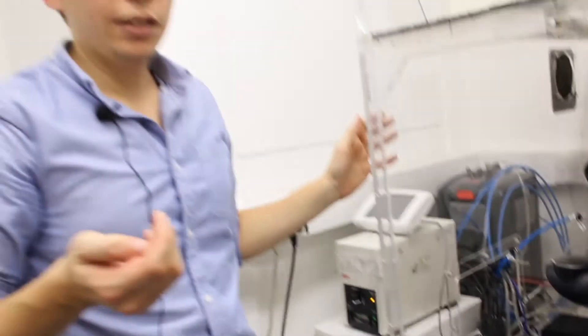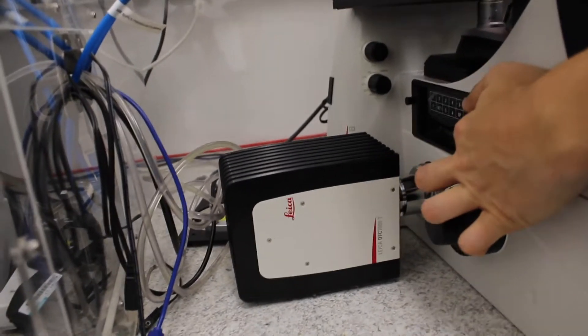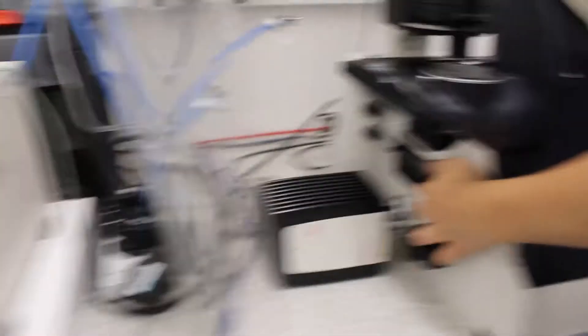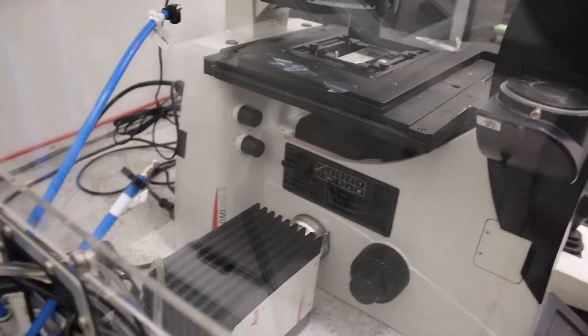Then you need to choose which filter cube you want to use depending on the sample that you want to see the fluorescence of. It's on this filter wheel and you have to choose the number, the position that you want to have the correct filter cube.